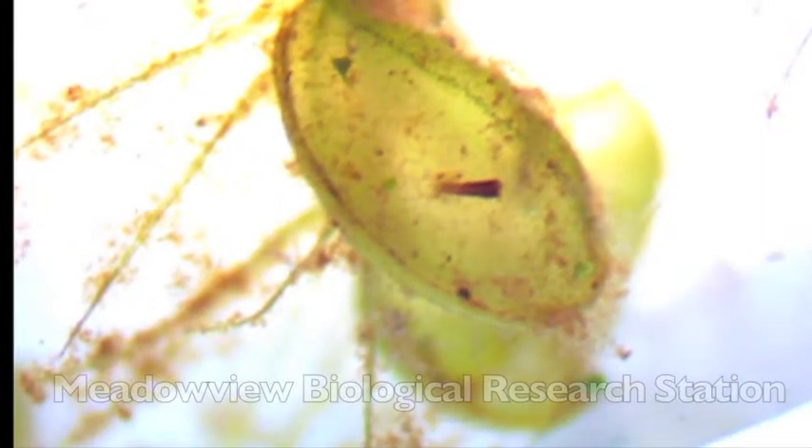In these clips we've triggered the traps to shut with a small probe. Here are a few more clips of the water wheel plant's traps in action.